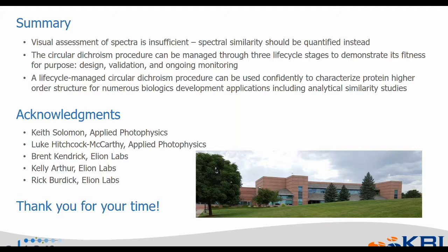Secondly, it is possible to manage the circular dichroism procedure and other characterization methods for that matter through 3 life cycle stages to demonstrate its fitness for purpose. The design phase, when we really try to understand the method, what it can do, and define the requirements for the method. The validation stage, where we demonstrate that the method is suitable for its purpose, and finally, ongoing monitoring of the method. And then finally, a life cycle managed circular dichroism procedure can be used confidently to characterize protein higher order structure for many different applications within biologics development, including what I've focused on, which is analytical similarity studies.